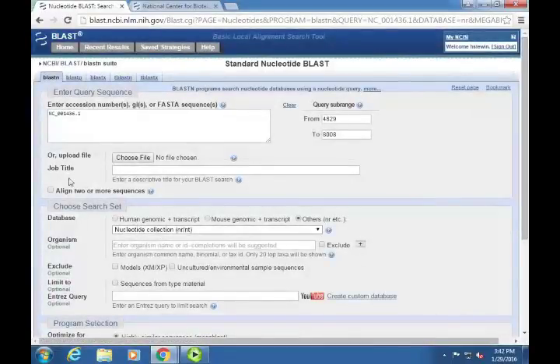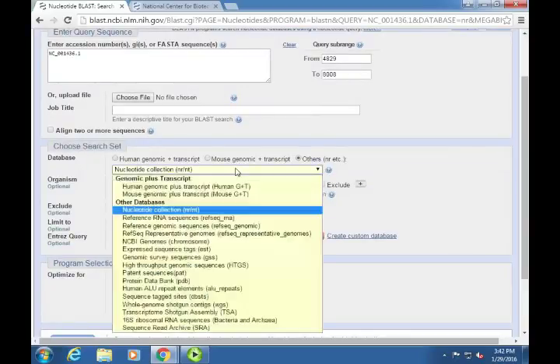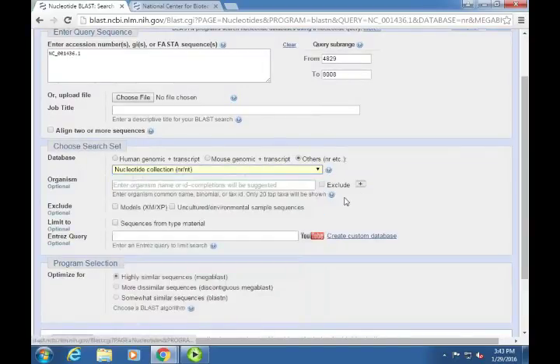So it's going to look like this when I run. And since I'm doing a nucleotide sequence, I'm doing a BLASTN. You can choose a file, you can choose a query. This is the reference sequence, and it's in this range. I'm doing nucleotide. I'm choosing which database it's coming from. I can choose an organism if I want to, but I'm not going to.